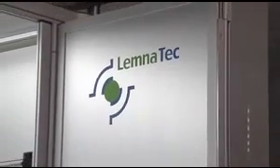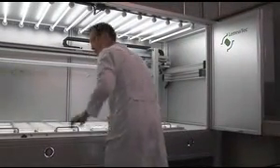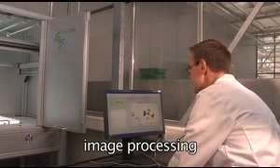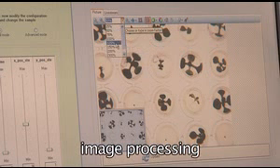During image acquisition, the systems are closed to ensure reproducibility of imaging conditions and to avoid any safety hazard caused by moving parts. Images are analyzed by the advanced, fully integrated Lemnatec image analysis tools, which provide hundreds of parameters per image immediately after each measurement process.